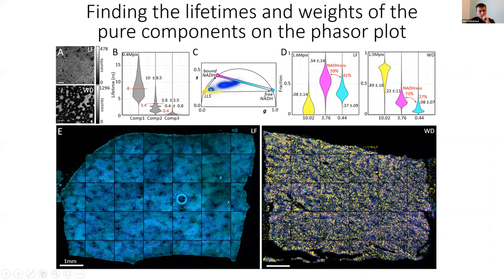And to finalize, we also applied the system on a known sample that had been used before for a previous study. This is mouse liver, in which you have mice that have a low-fat diet and mice that have what they call the Western diet, a high-fat content diet. As you can see in the images, you can already tell just by eye that there are these big fat droplets here. But if you measure by lifetime, the previous paper showed that there was a long lifetime species component. And in this case, without knowing this a priori, we ran the algorithm and obtained the same value of the lifetime species at around 8 nanoseconds. And we showed that there was a much higher proportion of the lifetime species in the Western diet compared to the low-fat diet. And if you map these colors to the original images, you see it's completely different one from the other. Yep, and that's about it.